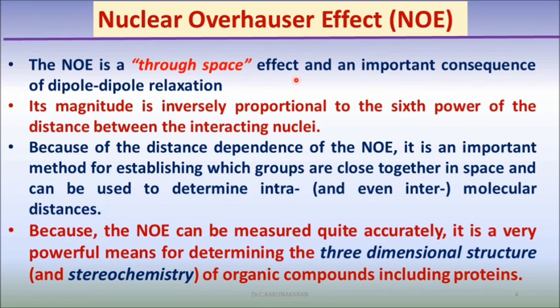The NOE effect occurs through space due to dipole-dipole interaction relaxation. Its magnitude is inversely proportional to the sixth power of the distance between the two interacting nuclei, for example, A and B in this case. It is useful for studying the three-dimensional structure and stereochemistry of organic compounds.